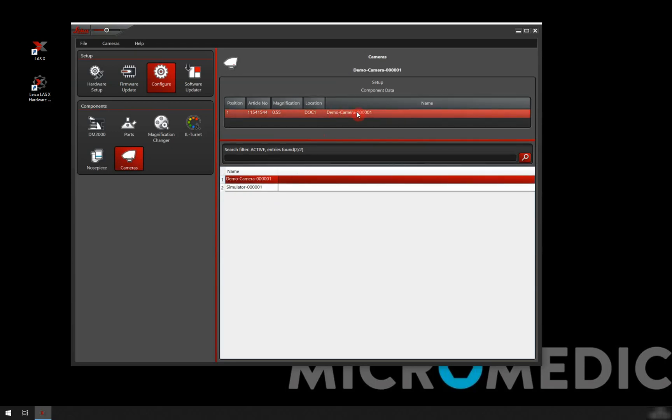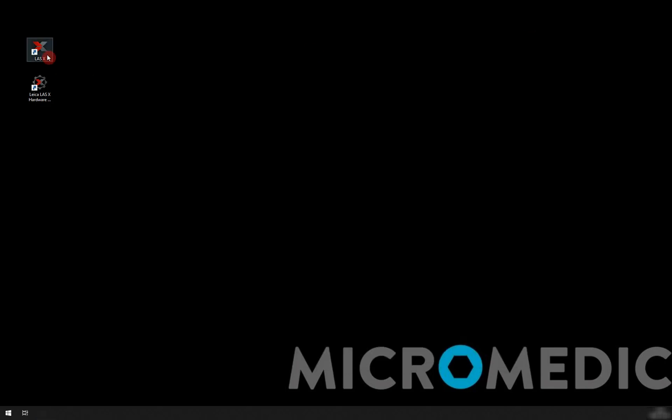So that's it. I've set up and configured my microscope. So I'm ready to just close this down and start LSX to start doing some imaging.